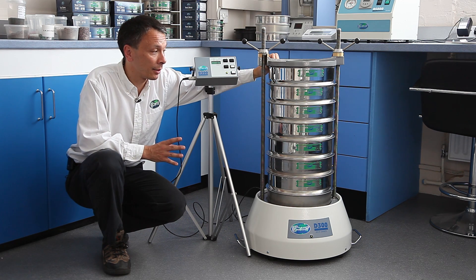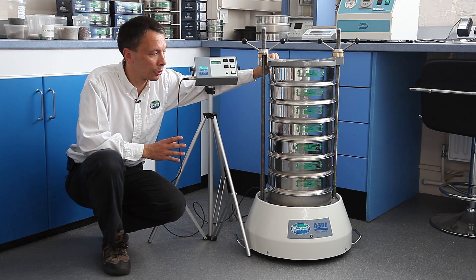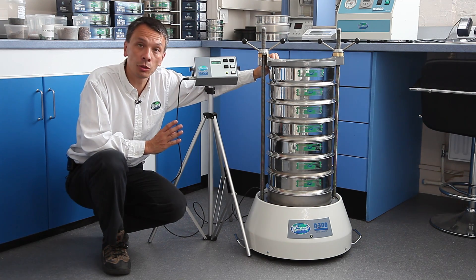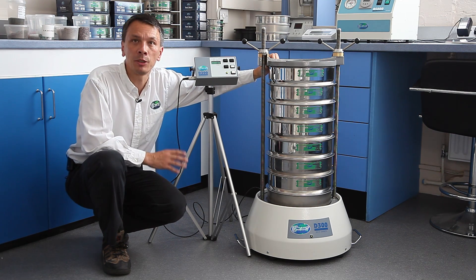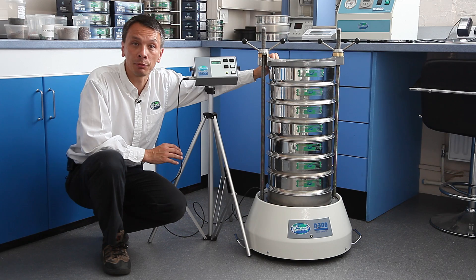It is totally operator controlled with different parameters that you are able to adjust, and also versatile in that you can use 200 millimeter sieves, 300 millimeter sieves, and 315 millimeter sieves. Many markets require a shaker to have that type of flexibility.